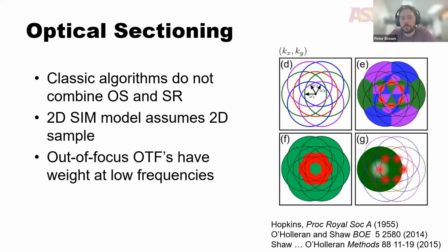This is a big problem because this extra light undergoes our regular SIM demixing process the same way that the in-focus signal does. And that means that this out of focus light, which is predominantly at DC in our image, gets mixed into our higher order SIM bands, and therefore in the reconstruction algorithm, it gets shifted out to approximately the position of the SIM frequencies.